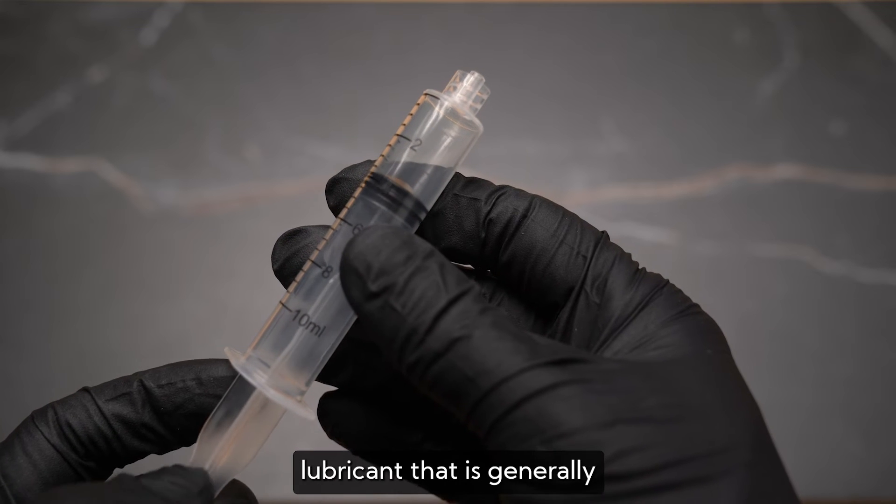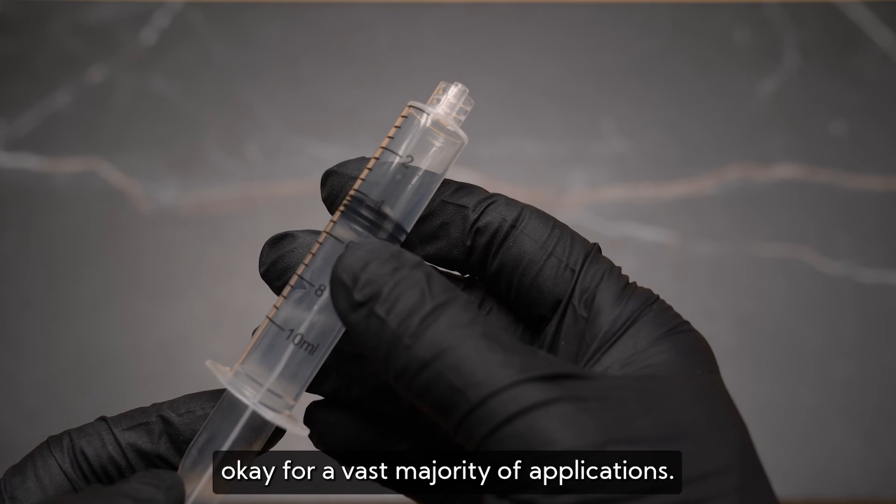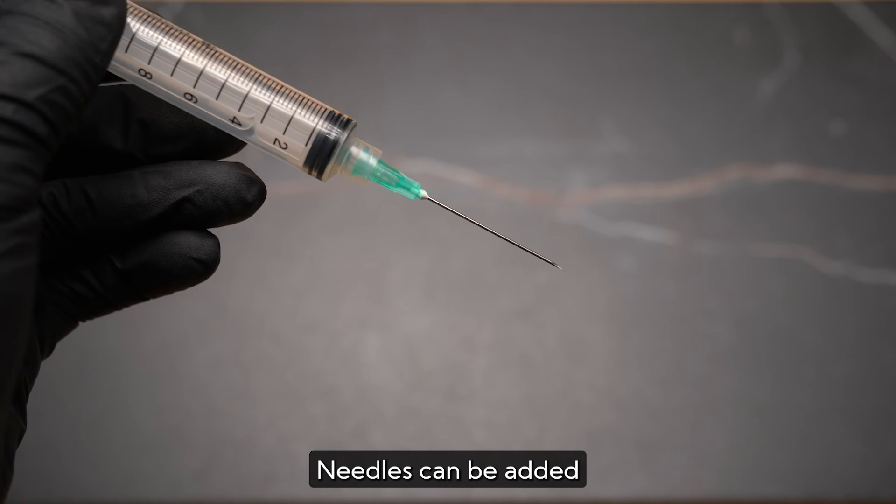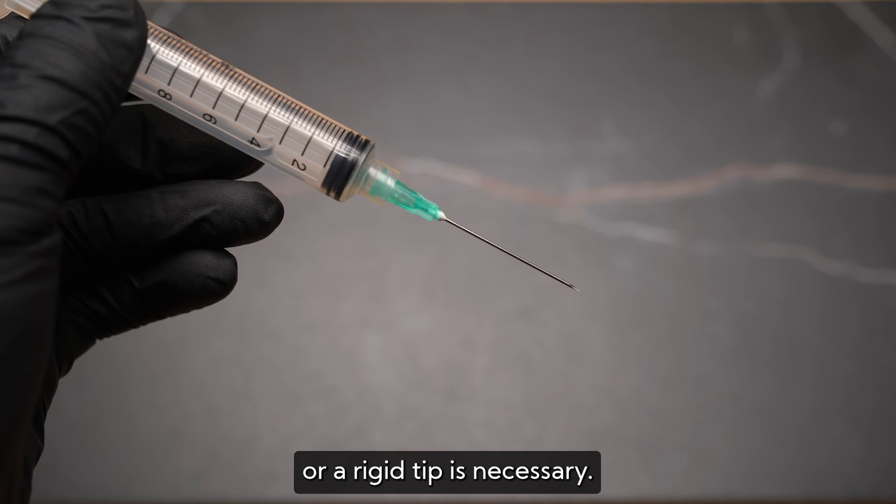Rubber syringes have a tiny amount of silicone lubricant that is generally okay for a vast majority of applications. Choose rubber-free syringes as a non-lubricant option. Needles can be added if puncturing or a rigid tip is necessary.